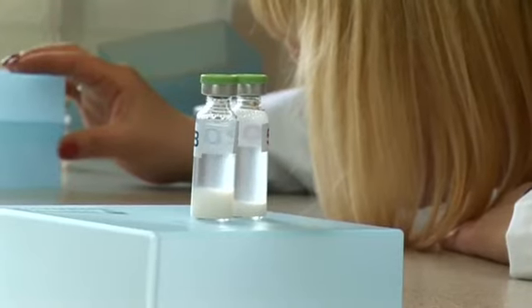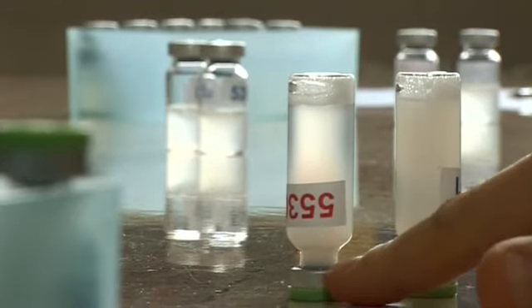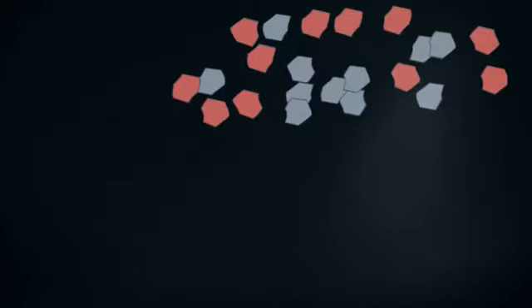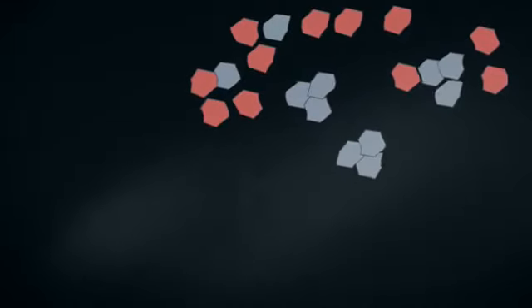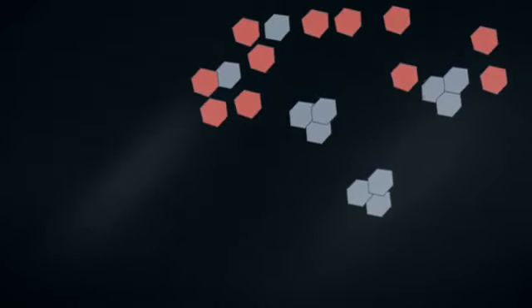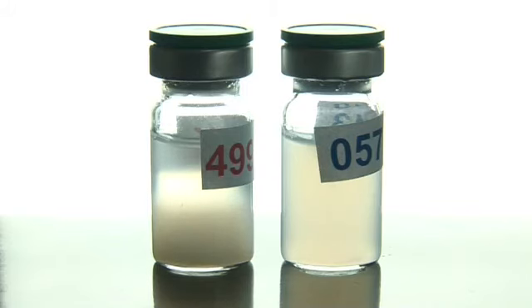When freezing is suspected, wherever you are, the shake test is the only tool available to confirm whether suspected vials can be used or not. The shake test has been validated by the World Health Organization and is 100% sensitive and 100% specific. It correctly identifies all frozen and non-frozen vials by comparing them to a frozen control vial. All you have to do is to follow the learning guide.